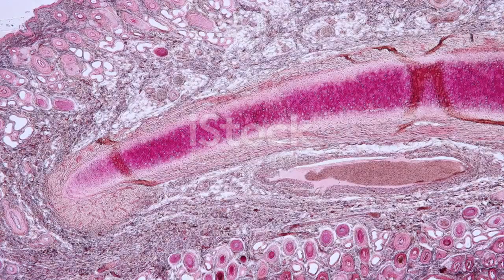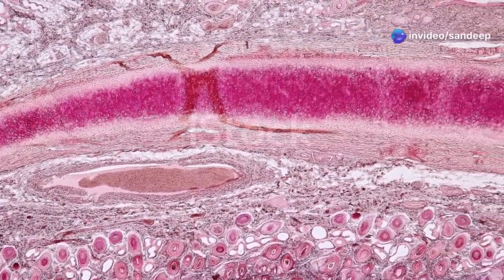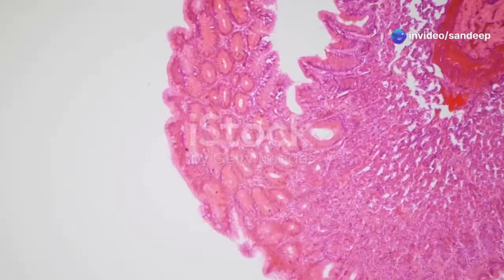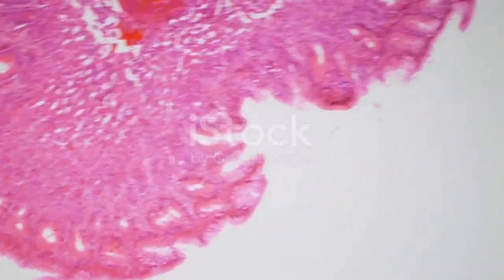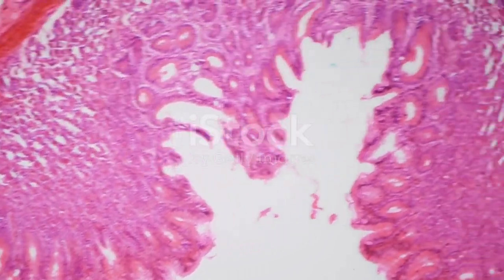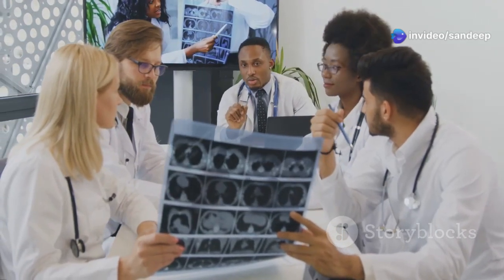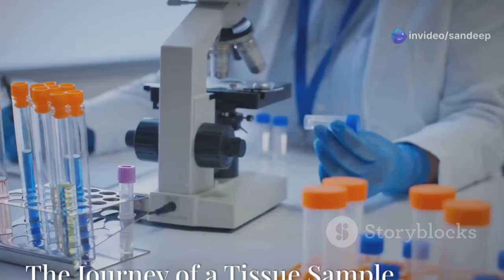These cancerous cells often display distinct changes in their size, shape, and organization compared to healthy cells. By examining biopsy samples, which are small pieces of tissue removed from the body, histologists can identify these cancerous cells and determine the type and stage of cancer. This information is crucial for guiding treatment decisions and predicting the likely course of the disease.